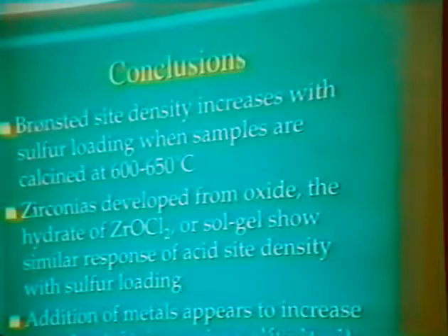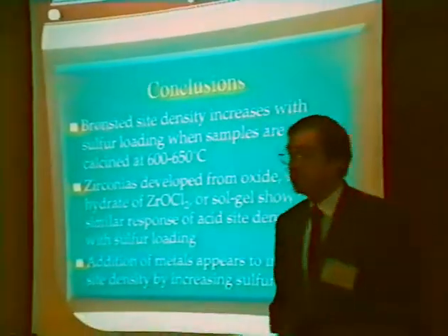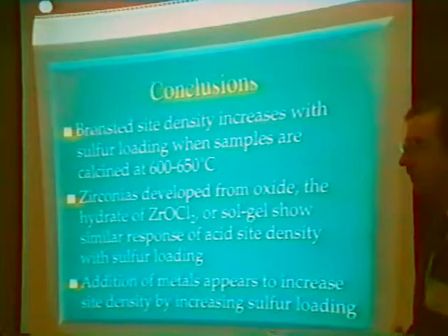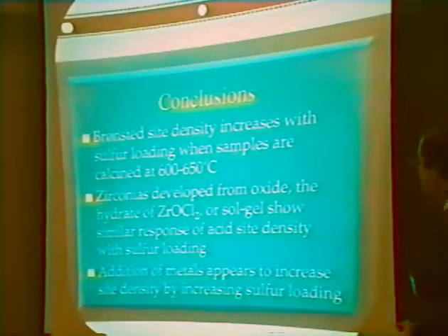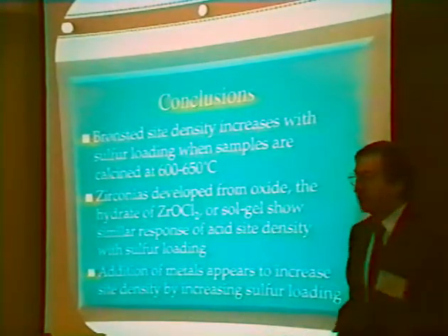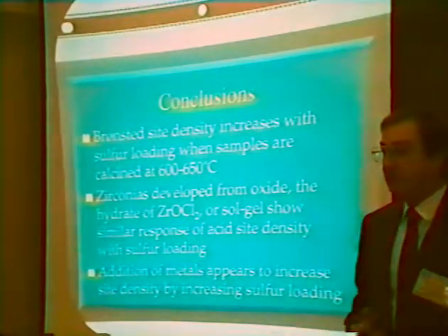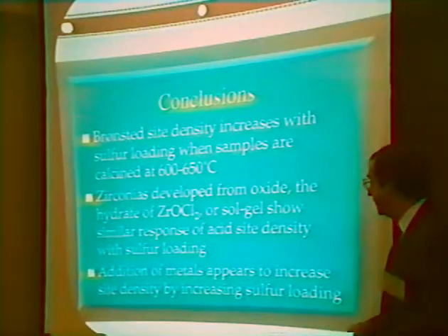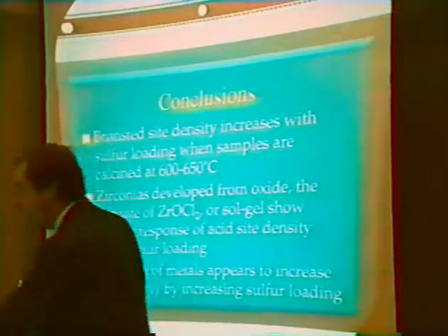And now for some conclusions. I hope we've provided some data for you that would suggest that this technique can be used to demonstrate the response of the system for sulfur loading, and that whether you use the oxychloride, the oxide, or the sol gel, the intrinsic chemistry is very similar, but of course the sulfur loadings are quite different. The addition of metals appears to increase the site density by increasing the sulfur loading. That is, you just have to be able to build more sulfur in the sample.